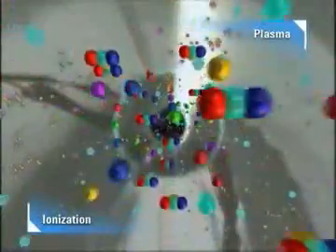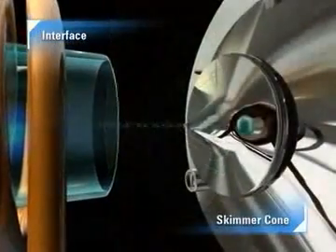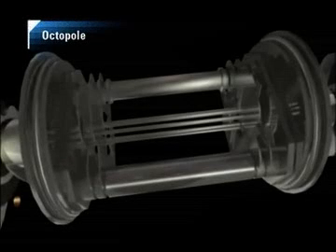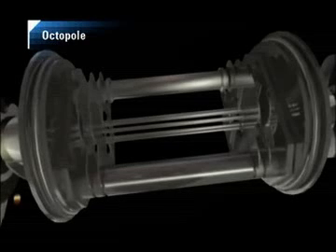The ions are extracted from the plasma into the interface through the sampling orifice, and then through the skimmer cone into the high-vacuum region containing the ion lenses and mass analyzer. Electrostatic lenses focus the ion beam and separate the positive ions from the unwanted neutral species by bending them into the reaction cell, the heart of the octopole reaction system, or ORS. The ORS is unique in using an octopole ion guide in the cell rather than the hexapoles and quadrupoles used in other cell ICP-MS systems.